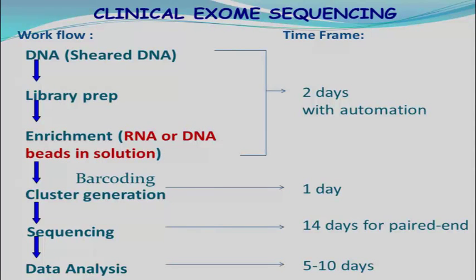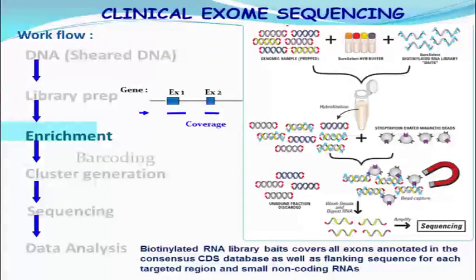Here is showing you the workflow for the exome sequencing. Once everything works perfectly, from day one when we start sample prep until the day we have the data analyzed, it probably takes at least 3 to 4 weeks. And this will be the exome capture assay.